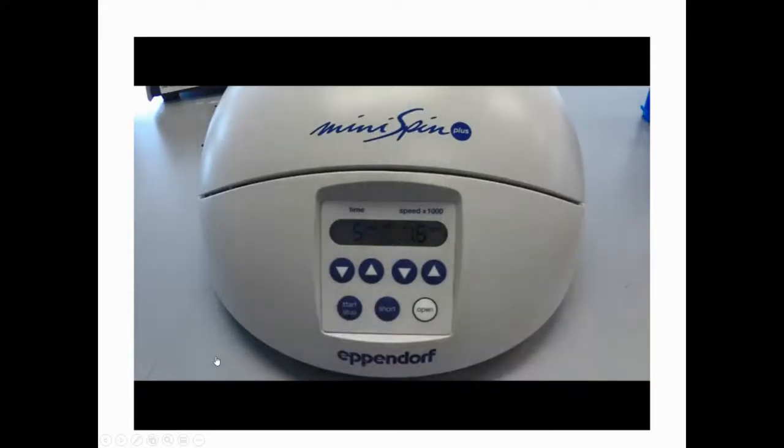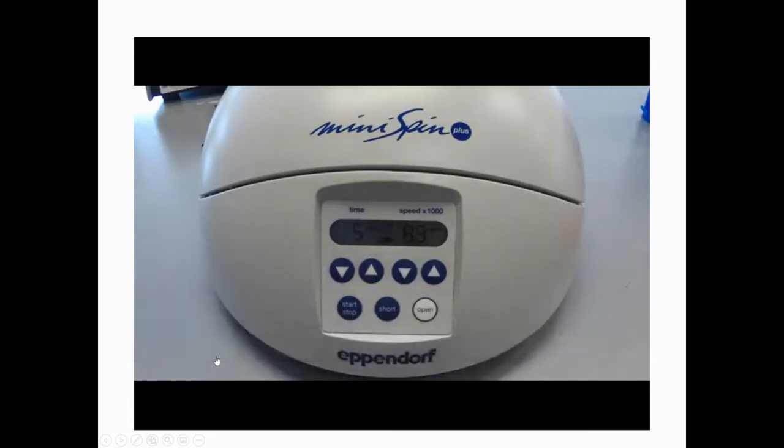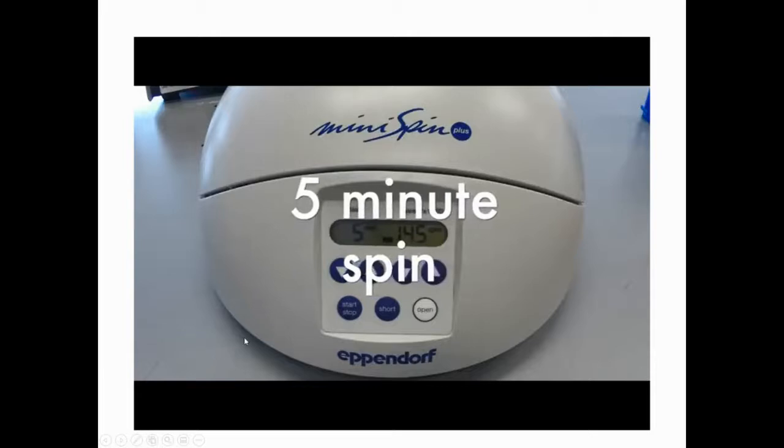The centrifuge will begin to spin. It is suggested that you watch the centrifuge until it reaches maximum speed to ensure that there are no violent vibrations, which may mean that the tubes are unbalanced or the internal lid has come loose. If this occurs, press the stop button immediately. When you place the tubes inside the microcentrifuge, it's very important that you balance the centrifuge. That means if you put one tube at one side, across the center on the opposite side you have to put another tube, so that you can balance the rotor.